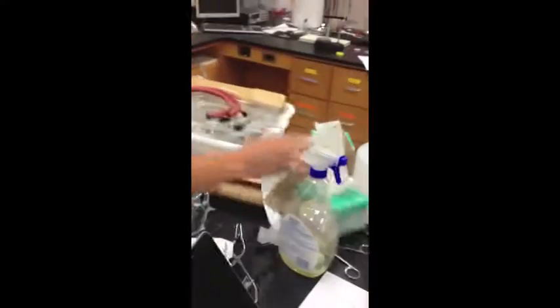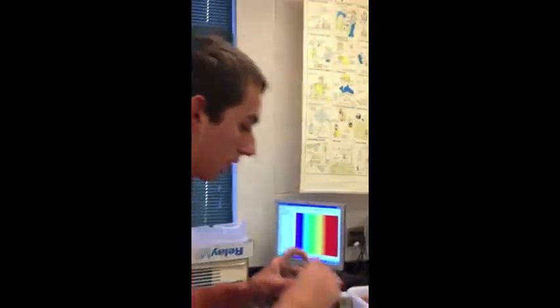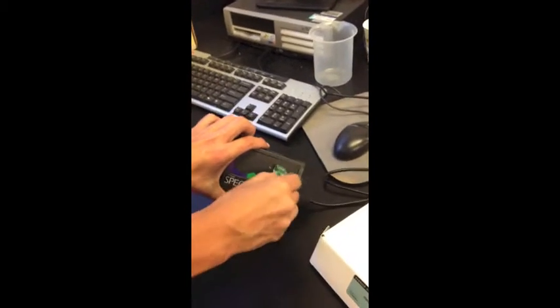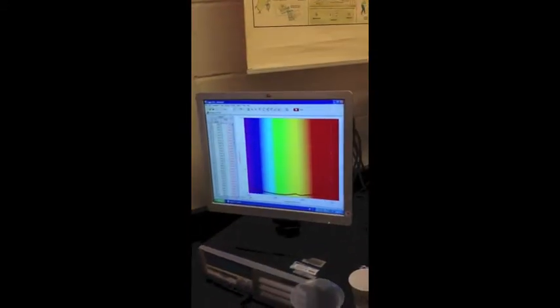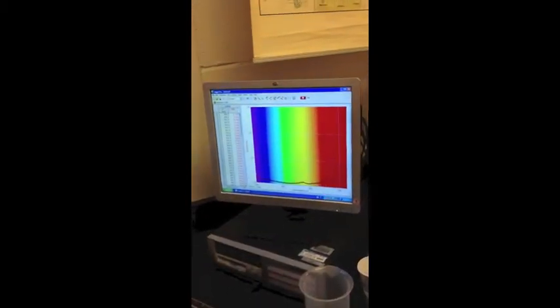Alright, and now, since we rinsed it out twice, we'll fill this up 3/4 of the way full. And cap it. Use one of our handy dandy Chem wipes to get all the liquid off and make sure the two sides are clean, because that's going through the machine. And put that in. So now you see we put it in. Clear edges go with the light. Now we're going to collect. And well, boom! That is our absorbance at different wavelengths for this solution.